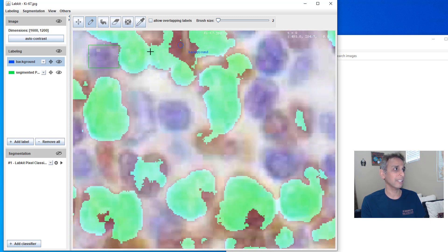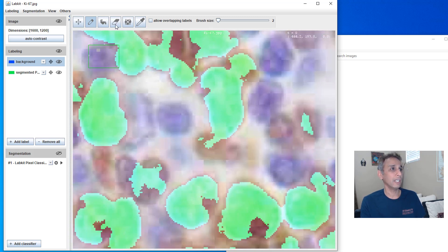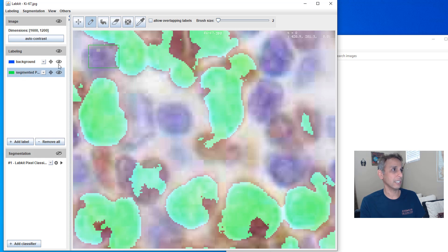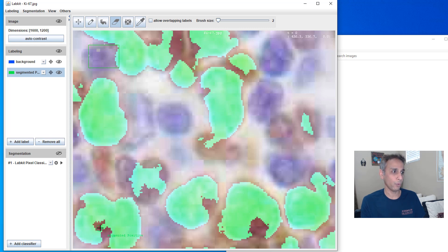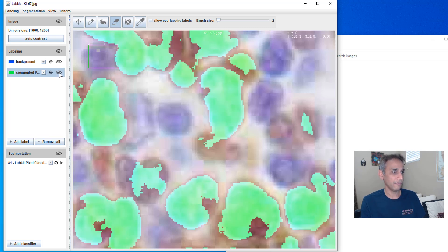If you don't like this, let me click on background. And let's actually click on the segmented eraser tool. Go ahead and erase certain regions. Yeah, this is probably a much better way.